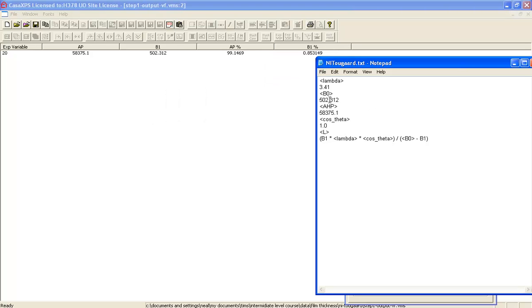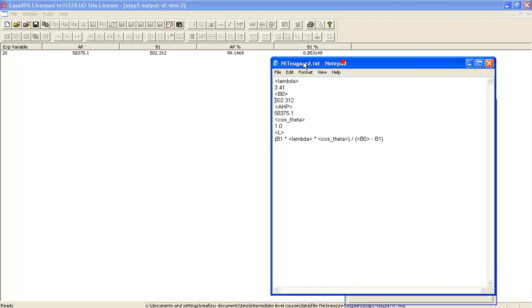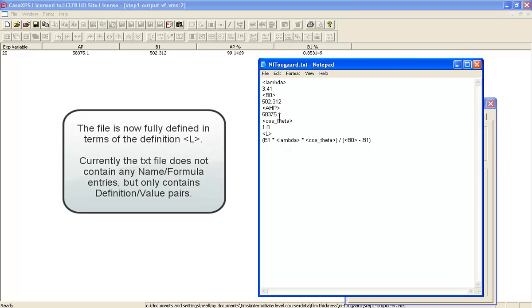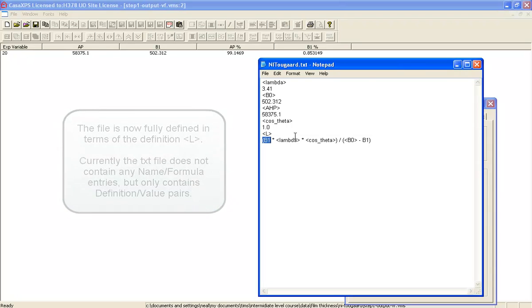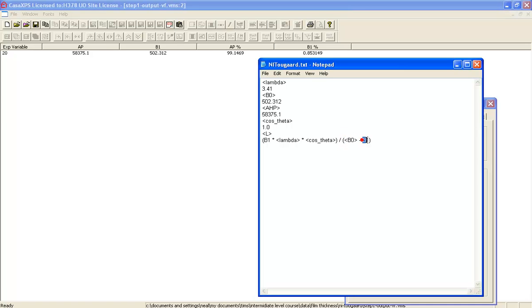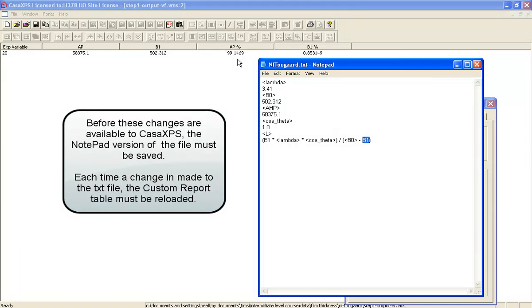So I've now got a file that contains lambda, that's a constant. I've got another constant here, another constant, cosine. And then I'm going to extract B1 from the file and multiply it by these constants that are predefined. Use another constant and subtract the value I'm going to extract from the file. So we'll save that.